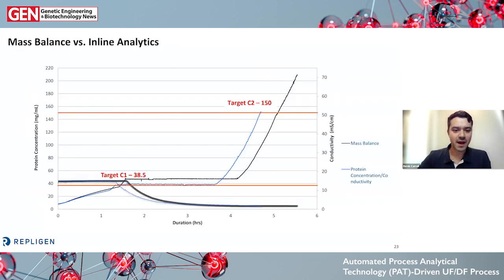We can look at the output of these experiments. You can see a comparison between, in gray, the mass balance, and in blue, the inline analytics.